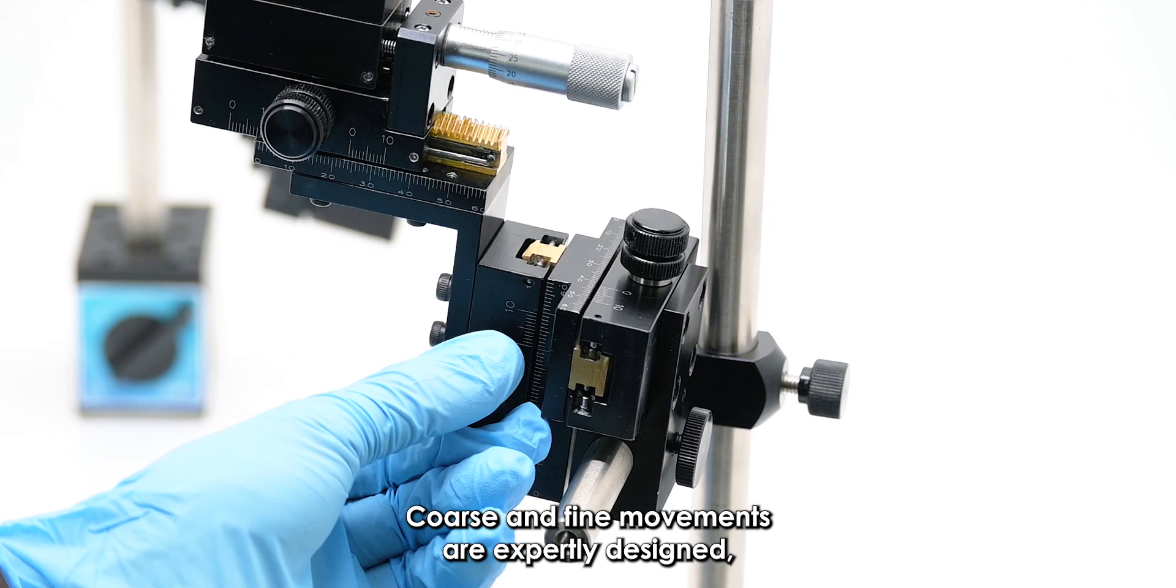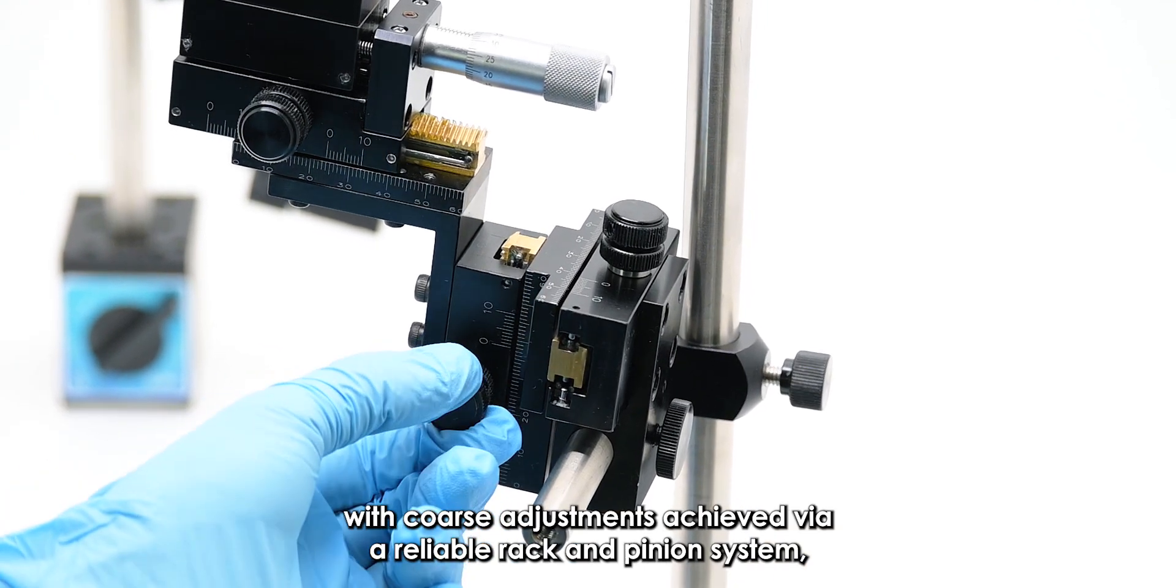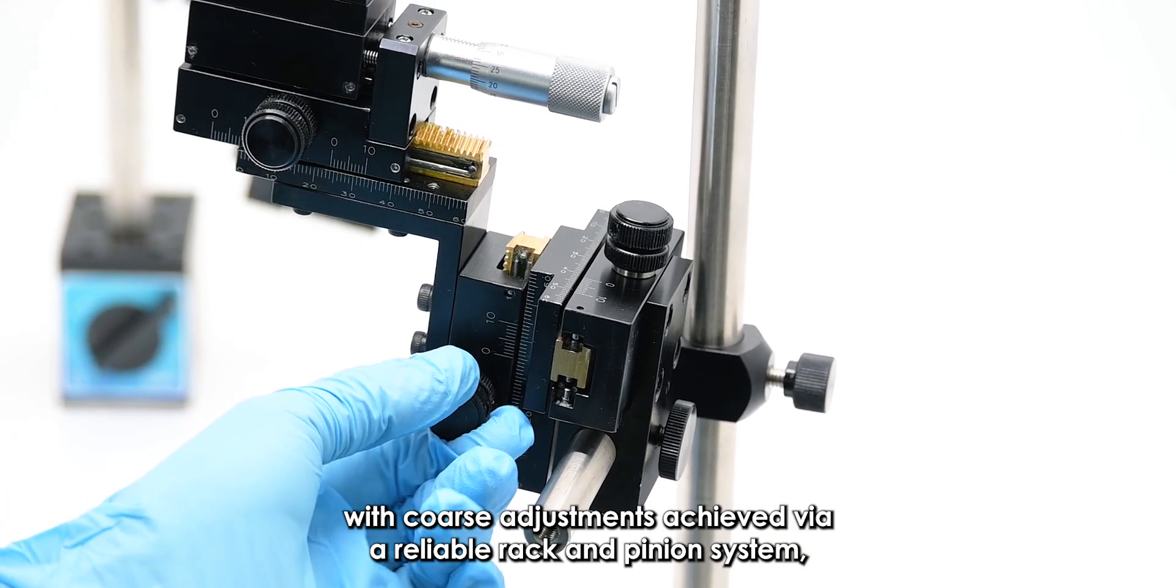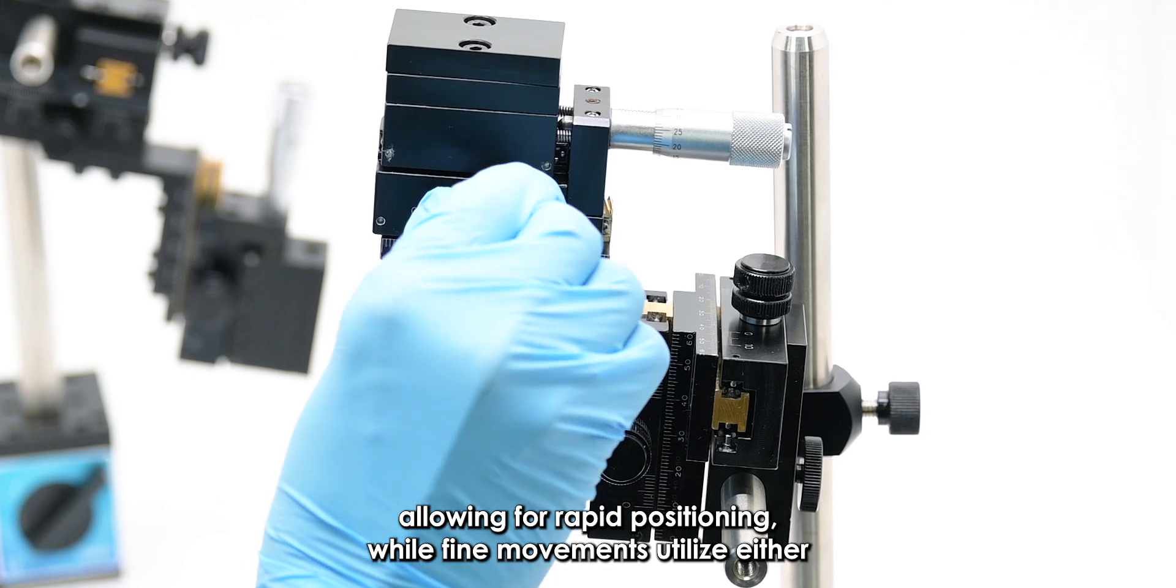Coarse and fine movements are expertly designed, with coarse adjustments achieved via a reliable rack and pinion system, allowing for rapid positioning.